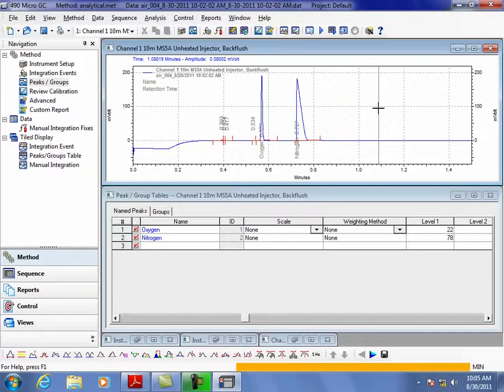The point is that the calibration gas should have a similar composition to whatever you're going to look at. That's absolutely right. But higher. It should have a similar composition to what you're going to look at in its highest test range. Yeah. Because the other side of that equation is, let's say I know that I'm going to be looking at 100 ppm to 1%, so I'm going to make my top standard 1%.